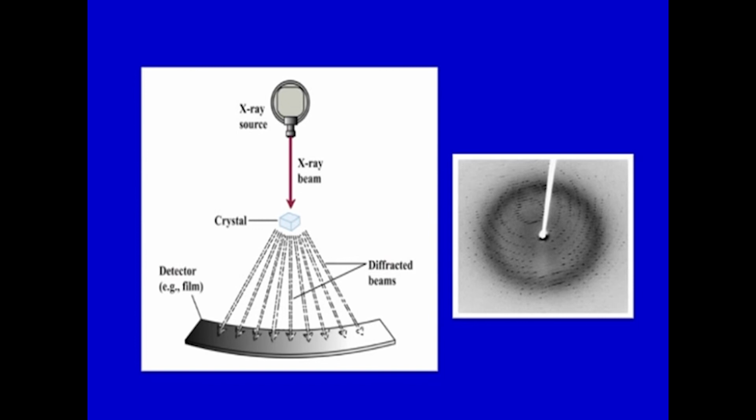Now, you can see this is the center, and as you go to the periphery, there is more diffraction towards this side, and we get higher resolution. It means the lower the value, say 1 angstrom resolution, the higher the resolution. If we get 2 angstrom or 3 angstrom, then it is a lower resolution. So, depending on how much information, that is, if 2 closely spaced atoms can be resolved, then it is higher resolution, and it will be obtained when there is higher reflection or higher diffraction at a higher angle.